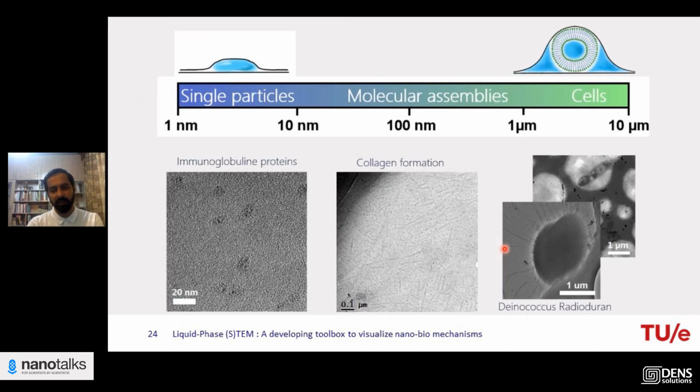And what I was thinking about and what we are aiming for is whether we can image these small particles very close to the cell, and when they interact with the cell in this very thin encapsulated region, confined region, where they start to interact with the cells.